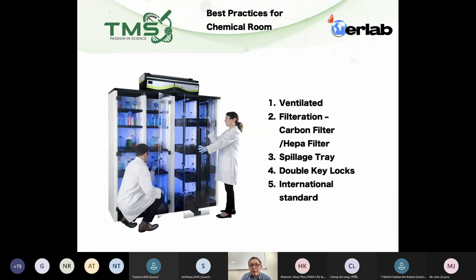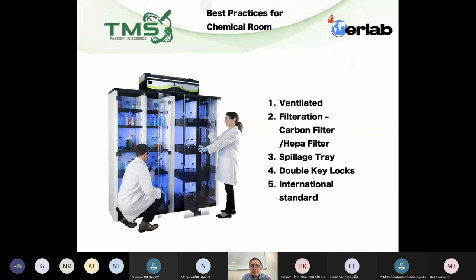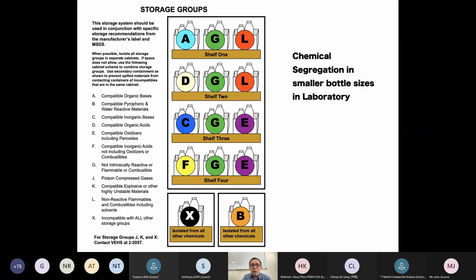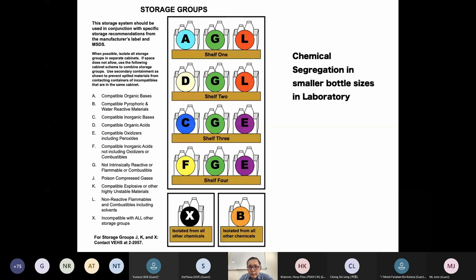For the working lab where you handle experiments and teaching, you should have a storage system with a transparent door that allows you to segregate different chemicals within one single storage unit to save costs. There is a publication I can email you — free of charge — that explains how to segregate chemicals in a multi-risk transparent door storage system.